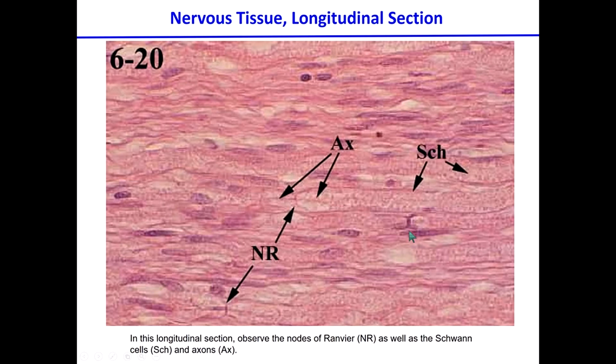So this is a way in which the stain has done multiple cells at the same time. The one we saw a number of slides ago brought the question about the interruption between the two portions of the single cell that was myelinated. This showed you the general picture. All these nuclei correspond to the Schwann cells, and then the nodal ranvier are the breaks in the myelin sheath and where the depolarization events take place. Questions?